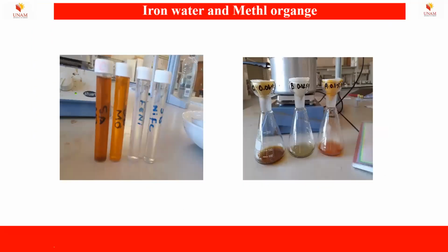So these are the samples. We have the standard orange one, methyl orange, and after treatment, we are getting the clear solution. And these are for the low concentrated, low loading with the MO.